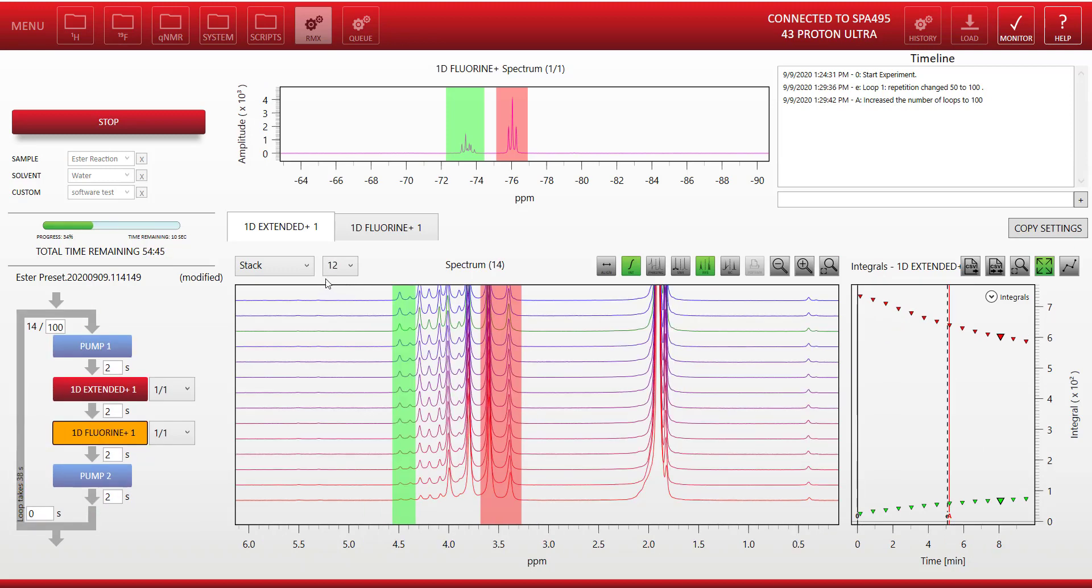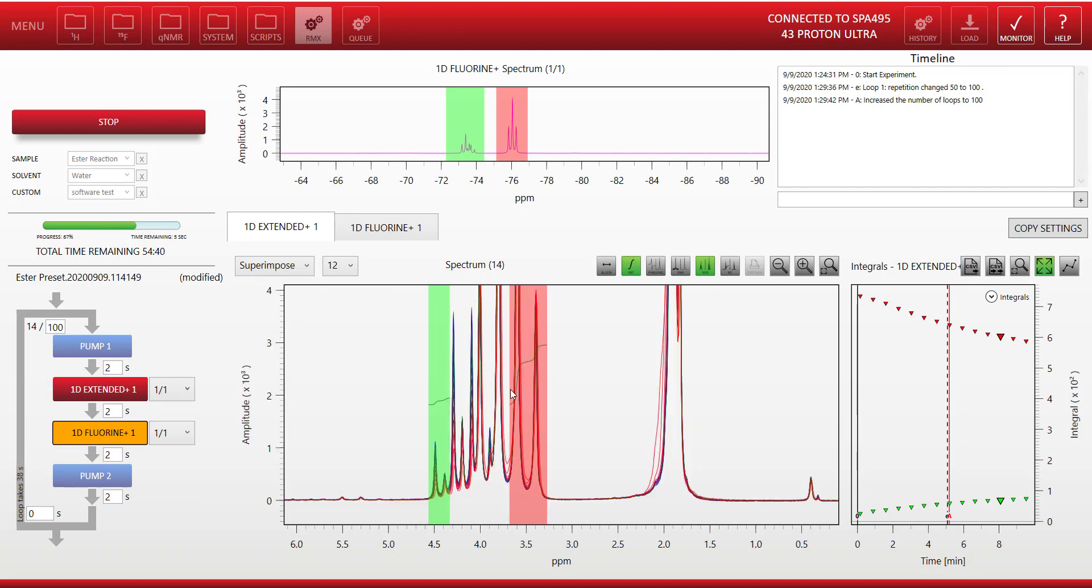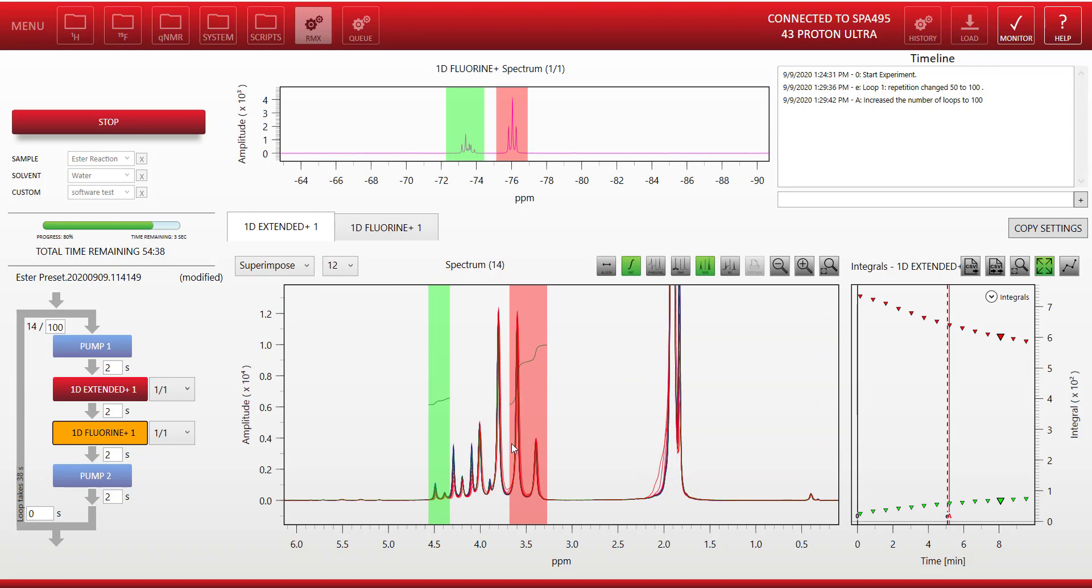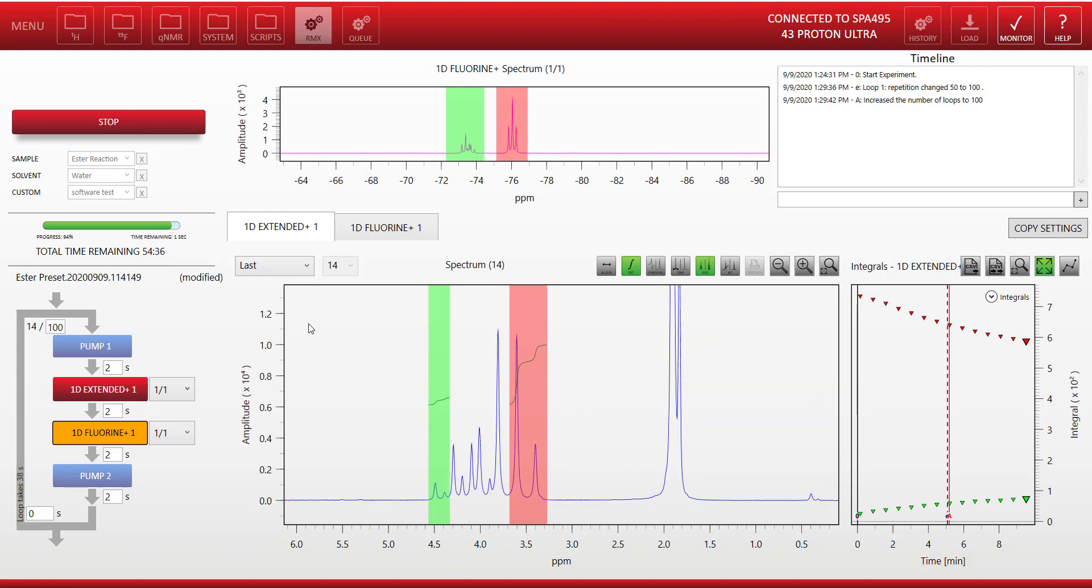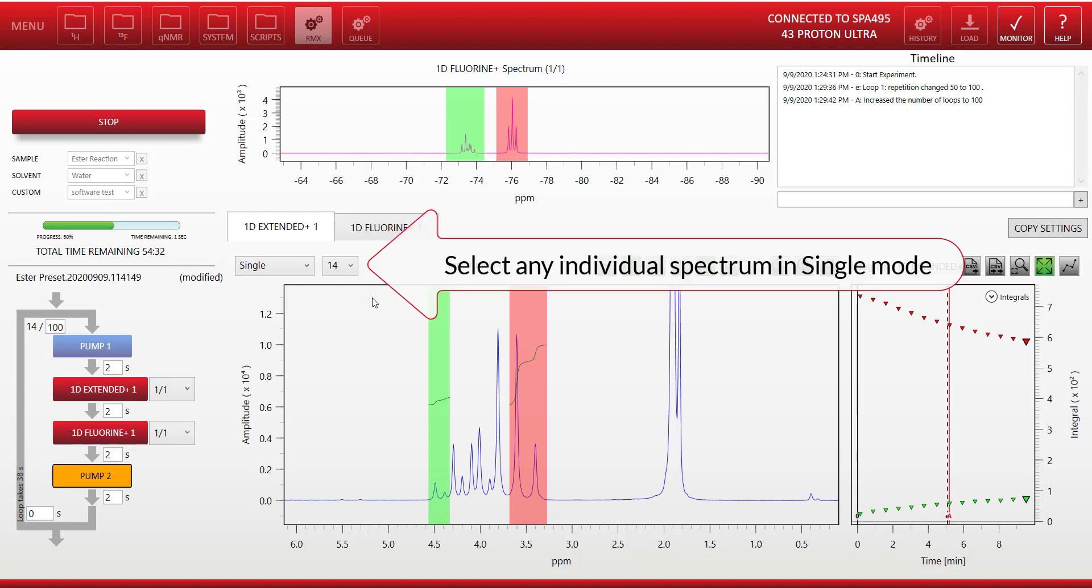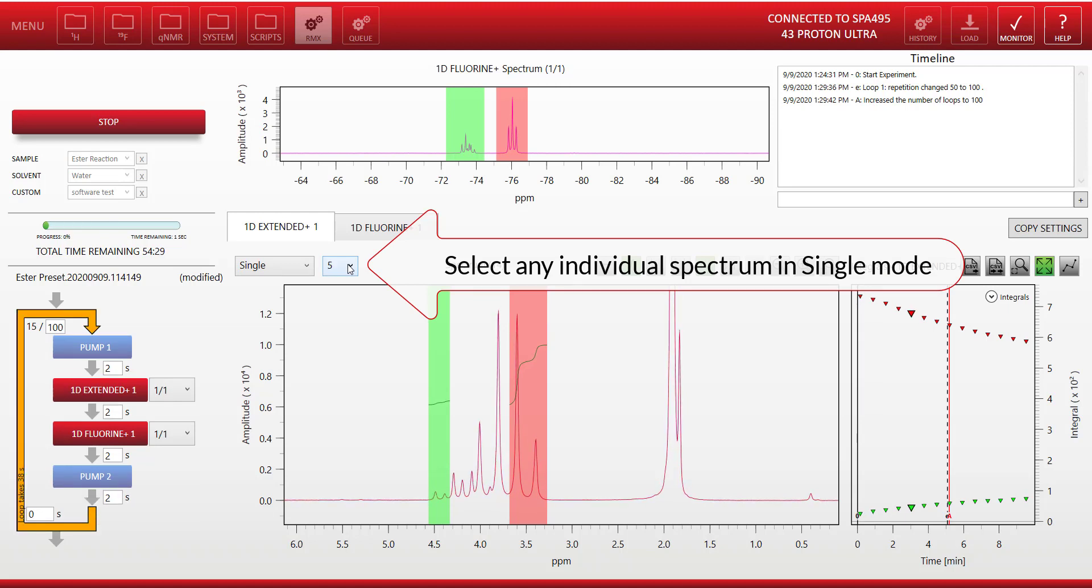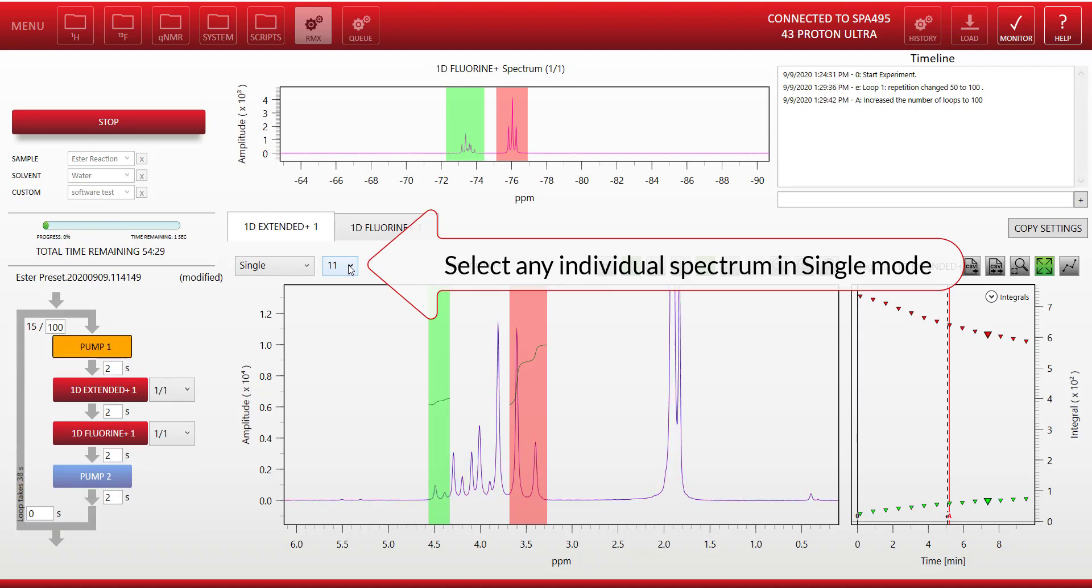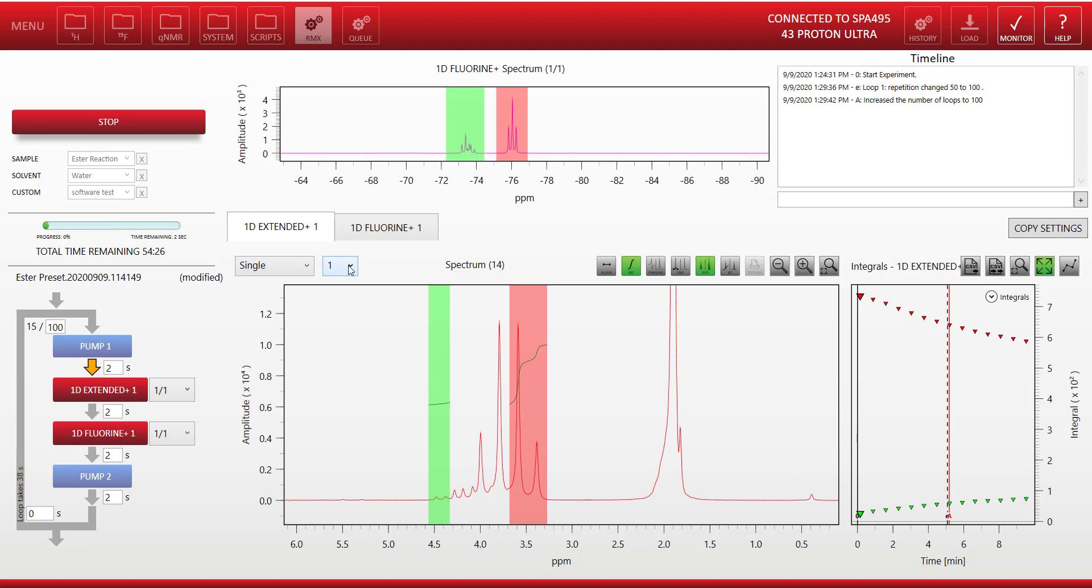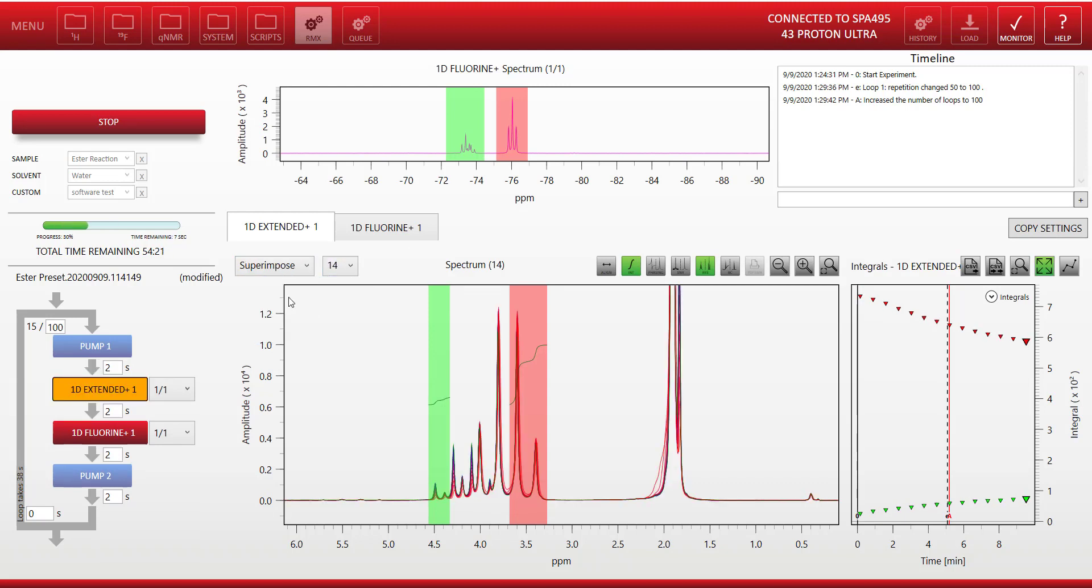Let me show you the different display modes for the accumulated data. The superimpose mode superimposes all the spectra on top of each other. The last mode shows the last acquired spectrum, so you can keep monitoring the current spectrum. And the single mode allows you to select any individual spectrum, so that you can zoom in and look at it in more detail, either a spectrum from the beginning of the reaction or towards the end of the reaction.